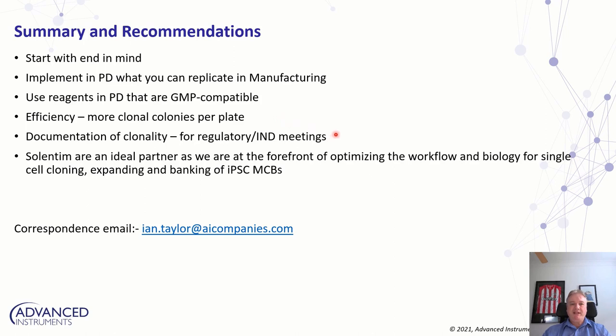We showed the documentation process in the clonality report. This has been tremendously important with the regulator for CHO cells, and we believe it will be exactly the same for iPSC clonal cell banks, that you will need to show these pictures and have this documentation ready for your IND meetings with the regulator.